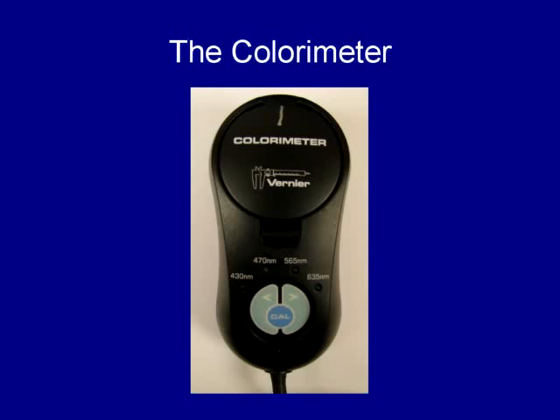First, let's talk about how to choose a proper wavelength. You have already noticed that there are 4 different numbers in front of your colorimeter. Every number is a wavelength and corresponds to a different color of light, hence the name colorimeter. You can change the color by pressing the arrows on the blue circle. Do not forget to recalibrate after you have changed to a different wavelength.